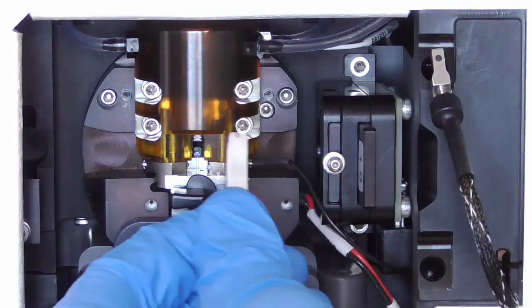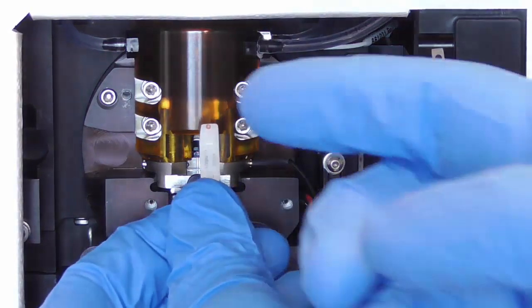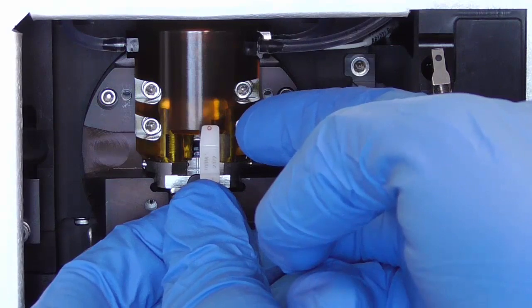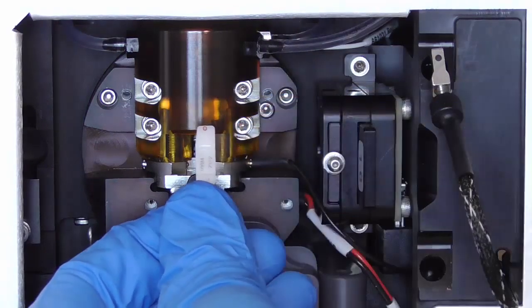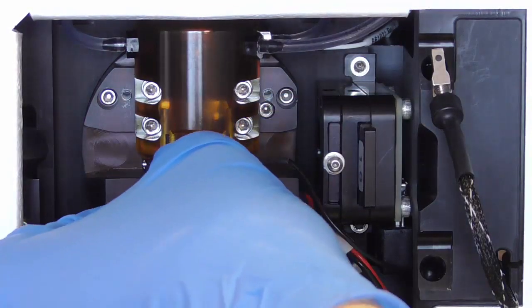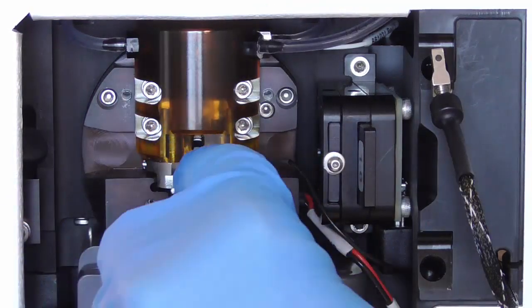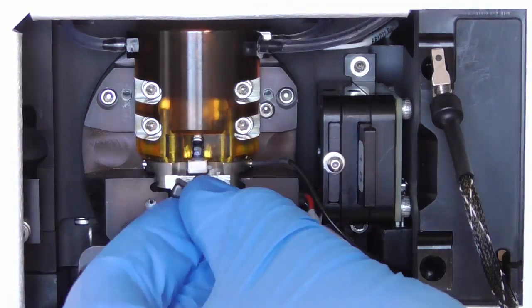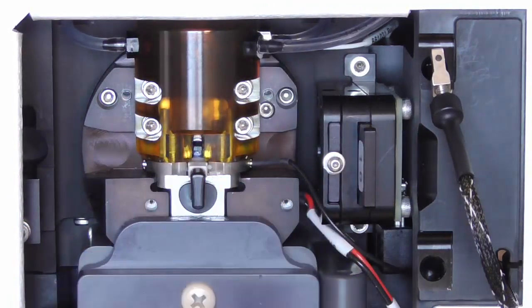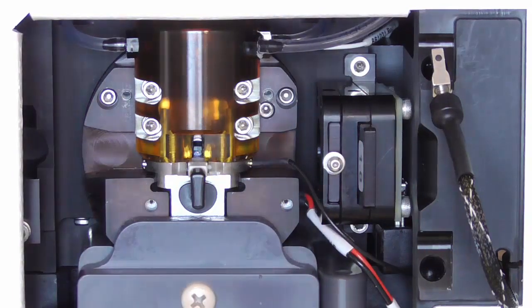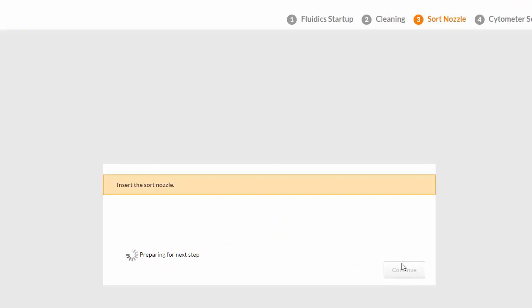Insert the sorting nozzle with the word Top facing up into place and push it all the way in. Turn the key clockwise to the 12 o'clock position to lock it into a fixed position. Click Continue and the system verifies that the sort nozzle is in place.